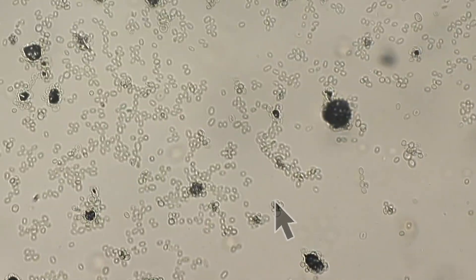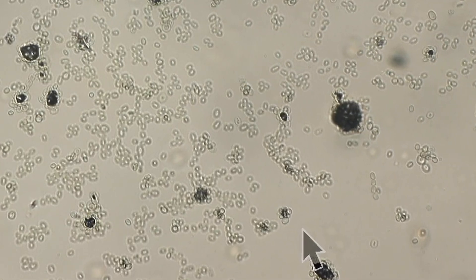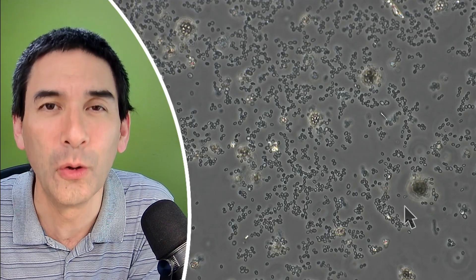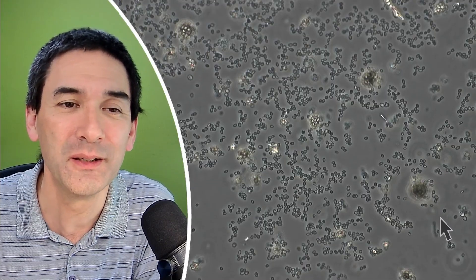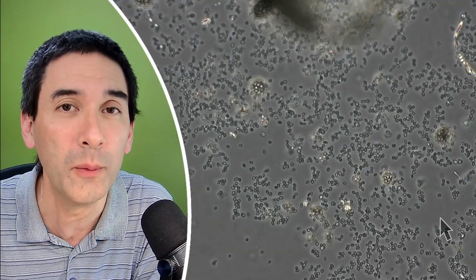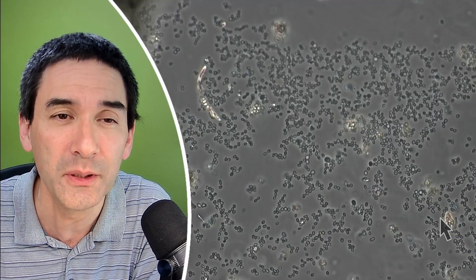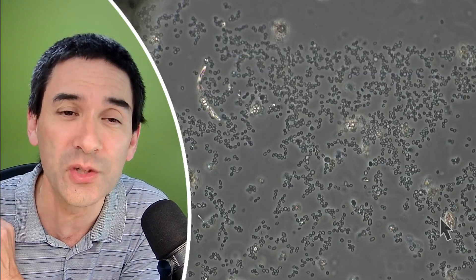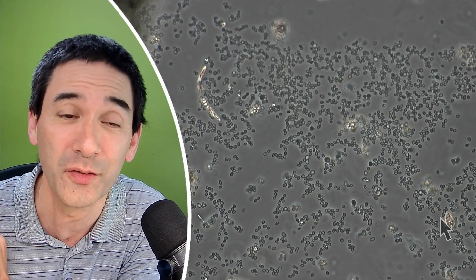So what I'm going to do now is have a look at this under phase contrast — maybe we're able to see them a little bit better. And yes, indeed — also 40x objective but now in phase contrast, and here it does look a little bit better, at least a little bit easier to see them. I'm not going to go up with the magnification yet further. The next higher magnification would be the 60x objective, but the working distance — the distance between the cover glass and the objective — is already so small that I'm worried I might be touching the glue which might have appeared out of the side of the cover glass.